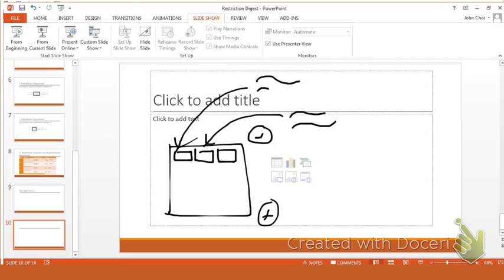It's negative charge, right? So DNA is going to want to go this way, and the smaller DNA pieces are going to go further. So Amar's really small piece is going to go all the way down here, and his slightly big piece is going to stay pretty close because it's too big to go far. And Wells is going to go kind of medium. Both of them are about the same size, so they're going to go the same distance.